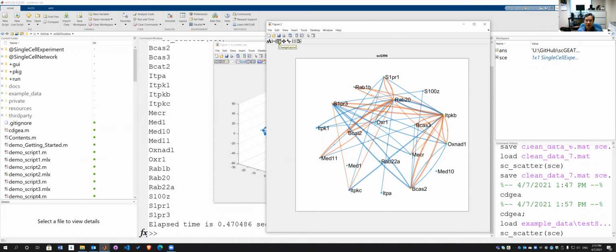And this is change the layout. I'm going to click this later. And this one will switch this so-called directional graph. So you see each linker between genes, there are arrows. That means the information is from this gene to that gene and not the other way around. The other way around was here, but it's too weak. It has been filtered out by this cutoff.